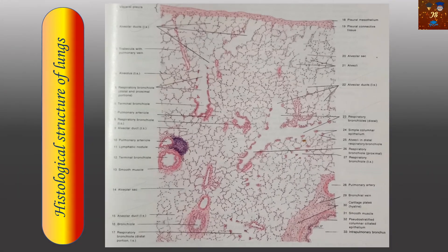The carbon dioxide gathered by the blood can be shifted to the lungs so that the lungs can expire that carbon dioxide from the body. Regarding the histological structure, you can see the alveolar ducts — these are the alveolar ducts, this hollow part — and there are lots and lots of alveolar ducts in the lungs.